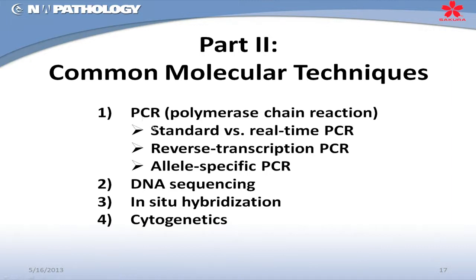PCR, again, polymerase chain reaction and its variants, sequencing, in situ hybridization, which has various forms that we'll describe here, and cytogenetics.